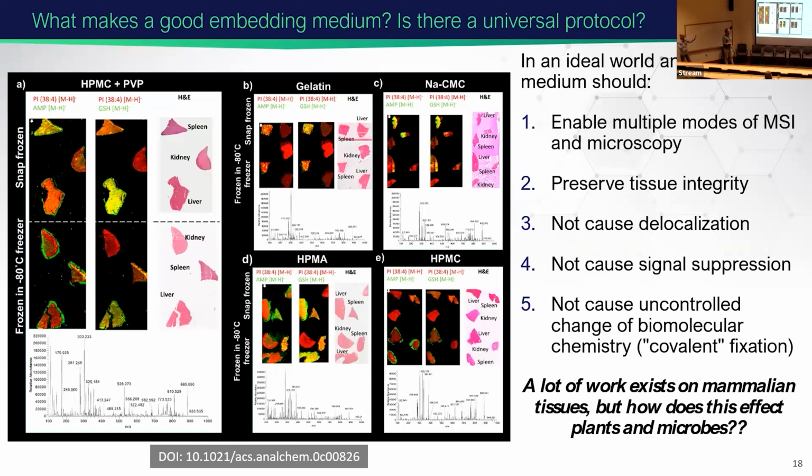a lot of those embedding materials have a lot of additives, or polymers that are so abundant in your mass spectrum that basically they are not useful there. And as I said, OCT is probably the most known for that.